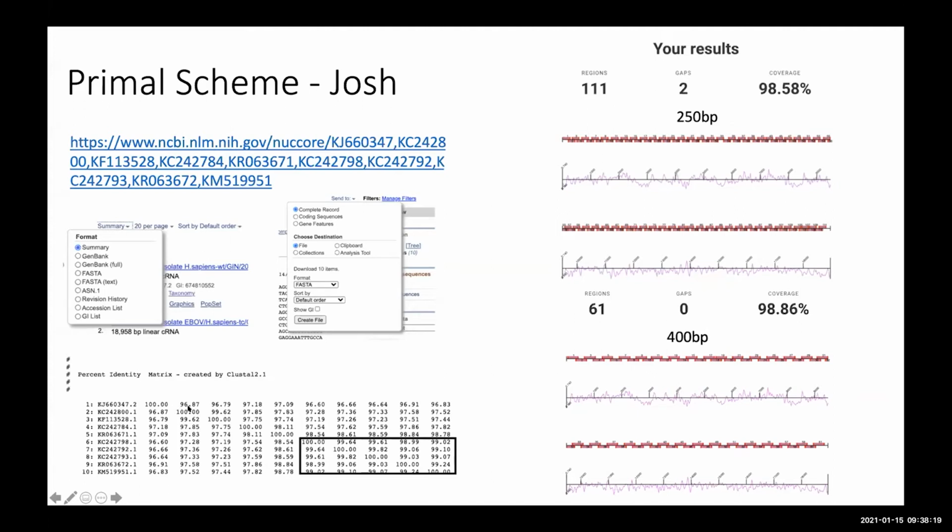And then for any given pair, you can see the distance. And so what you would have found is that, at least for the first 5 genomes, those genomes are quite different, maybe 2 to 3% sequence divergence. I think one of the questions was, which was the most different, which was the most diverged pair. More eagle-eyed people can probably pick that out. Pop it up in the chat if you've got an answer for that. Which of the 2, which pair are the most different?